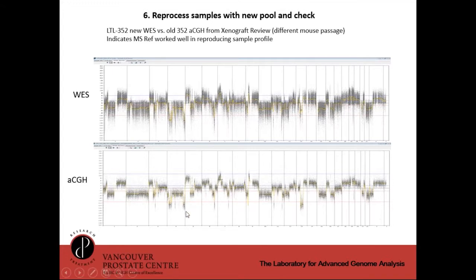And I guess chromosome 4 is a good example here, where we have two little homozygous deletions and a single copy loss here in that pattern. You can see pretty clearly right here. And there's another homozygous deletion, a dip right in the middle, focal.